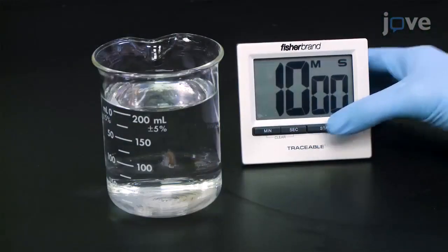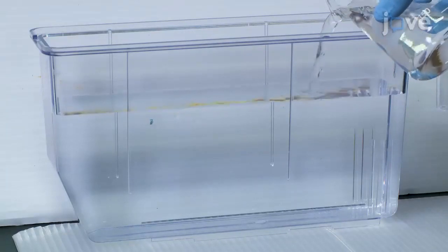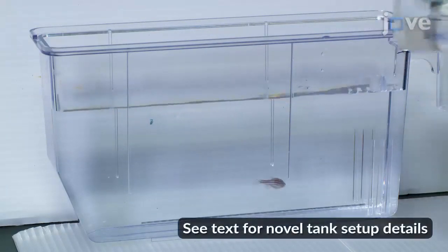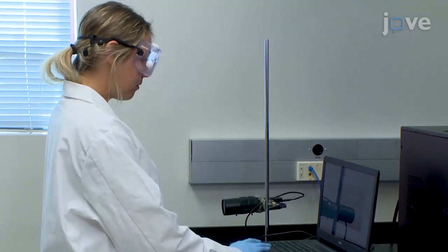Allow the adult fish to acclimate in the beaker for 10 minutes before gently pouring the water and the fish from the beaker into the experimental novel tank. As soon as the fish is in the tank, begin the camera recording and move away from the setup to prevent additional distress to the fish.